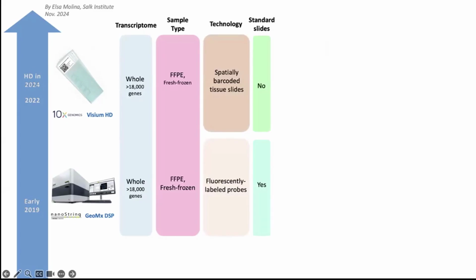And can you use standard slides? So for GeoMx, this is actually a standard microscopy slide that you can use. For Visium, this is a specific slide. So keep in mind that the Visium slide, you need to purchase it, and it's of course more expensive than the GeoMx slide, as it is a normal microscopy slide.